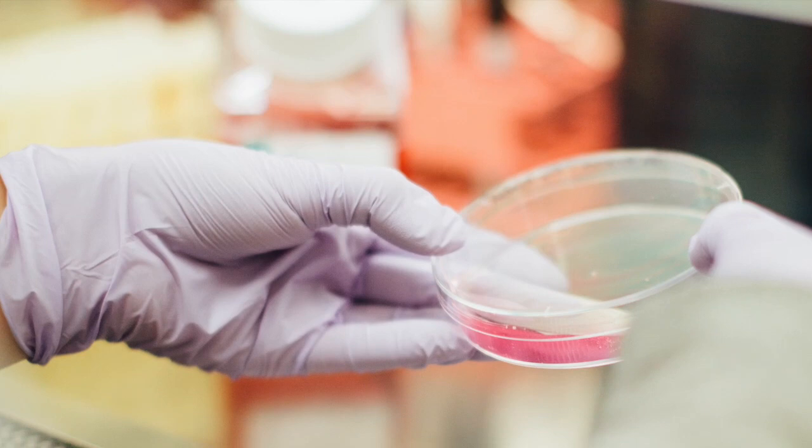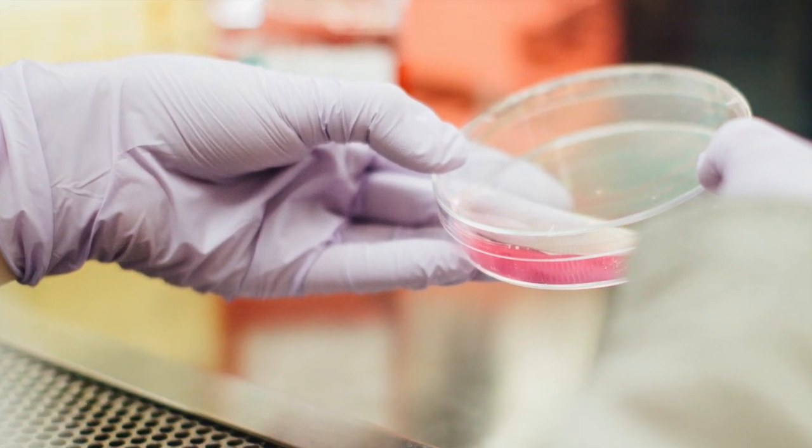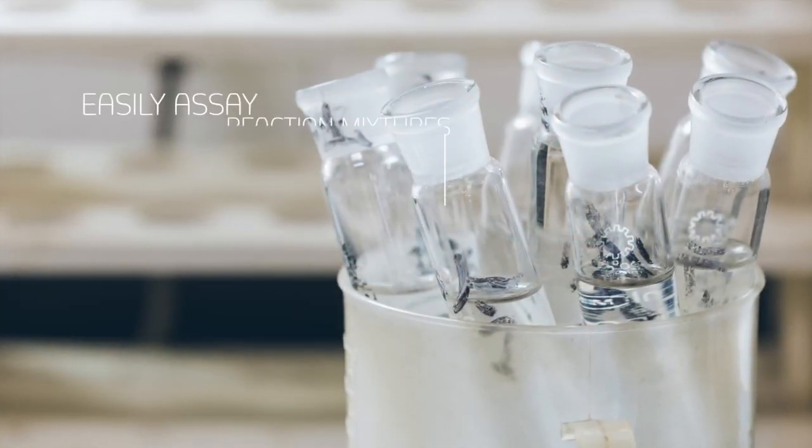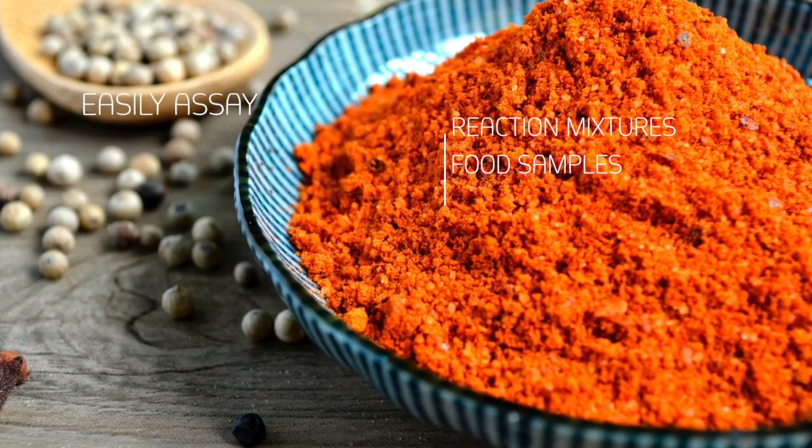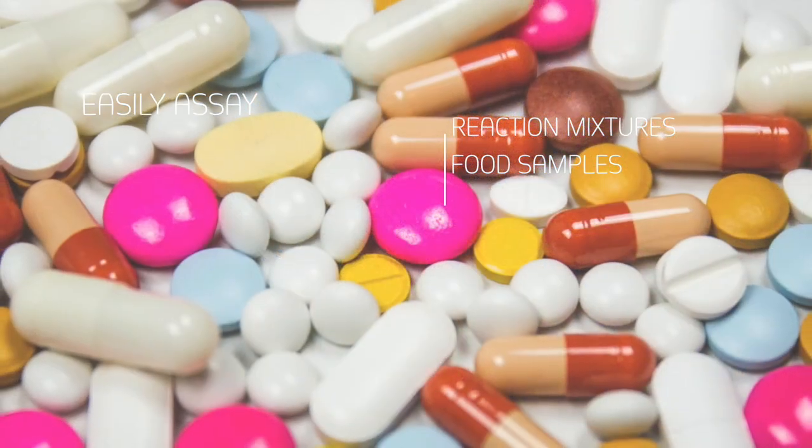This novel sample technique opens up a world of analysis for liquids and solid samples. Quickly and easily assay reaction mixtures, food samples, natural products, tablets, and more.